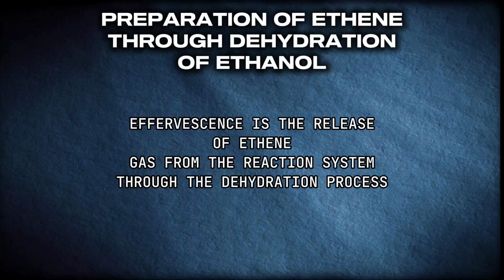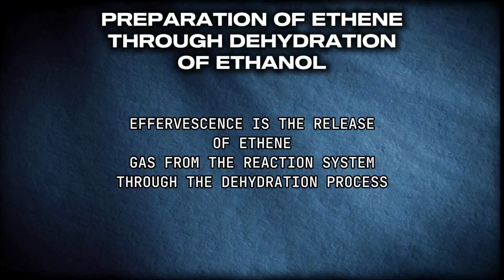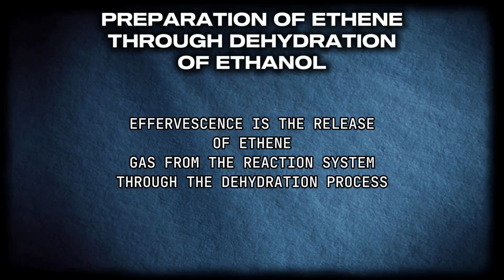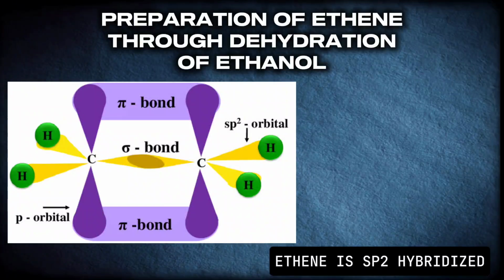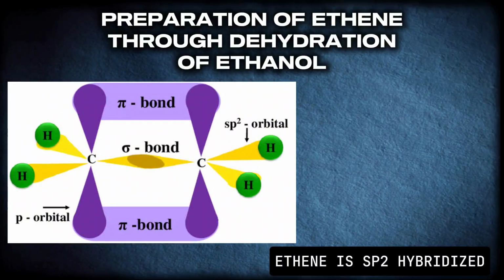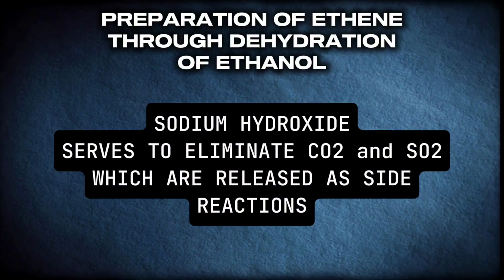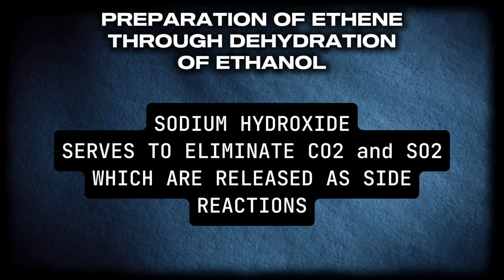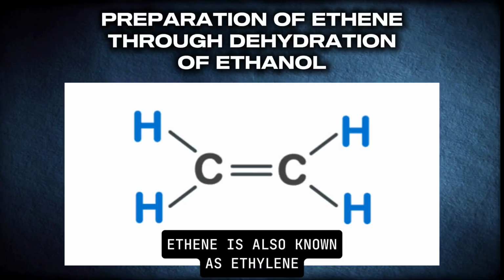Now, ethanol is heated. The gas that is produced, which is ethene, is passed through a 10% aqueous sodium hydroxide solution. This is to remove carbon(IV) oxide and sulfur(IV) oxide produced from side reactions. Right? The dehydration of ethanol doesn't just produce ethene and water being removed. There are some side reactions. So the essence of sodium hydroxide is to remove carbon(IV) oxide and sulfur(IV) oxide produced from side reactions.